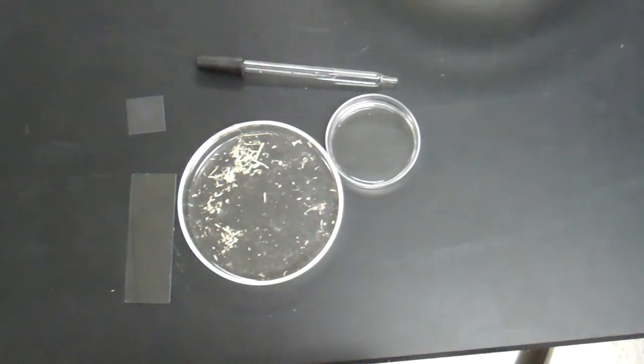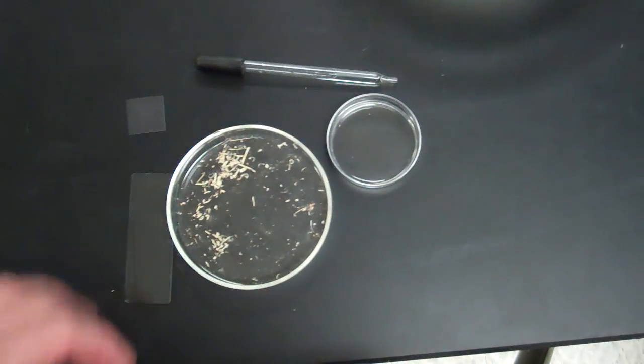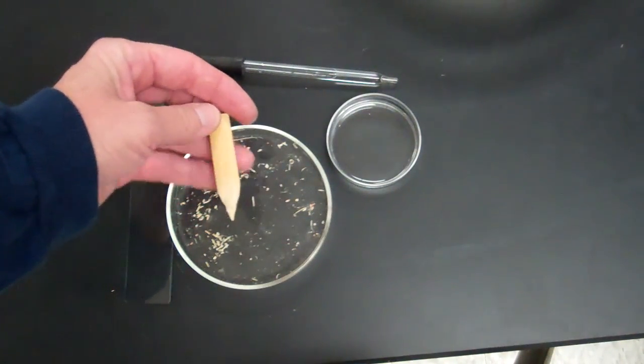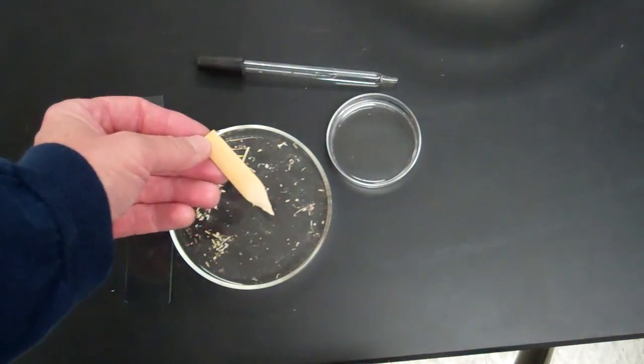This video is going to show you how to make a slide to see bamboo. These are bamboo shavings in my petri dish. They actually come from a clarinet reed that we shave down — clarinet reeds are made out of bamboo.